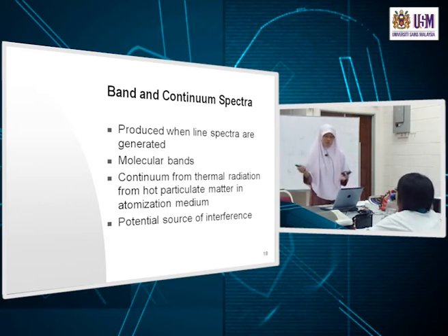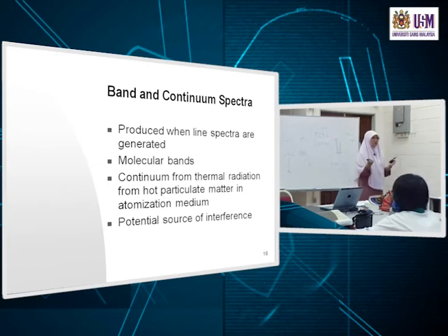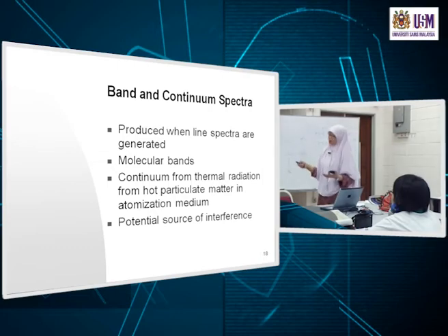So the process of atomization requires you to introduce your sample, not introduce your friend to somebody else, but you put your sample into your particular equipment. How do you want to introduce your sample? So you talk about sample introduction. How you want to get your sample into the system so that ultimately it can be changed to a vapor. All these things you'll be looking at again.